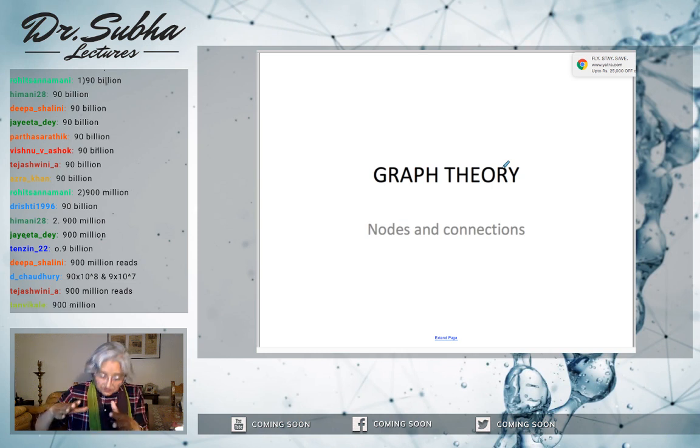Okay, so we did that, we got some concept ready. Now we are going to use it in the implementation. When they implement these things, it's complicated. You saw that 900 million reads you're going to have if you sequence human genome or any other mammal that hasn't been sequenced yet. Most of the mammals have 3 billion bases. So if you sequence them, you have a file that's 900 million reads. So the implementation has to be done well. You've got to weed out many things that you don't need.